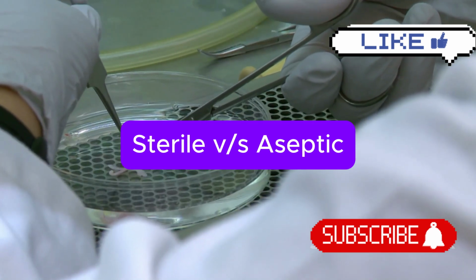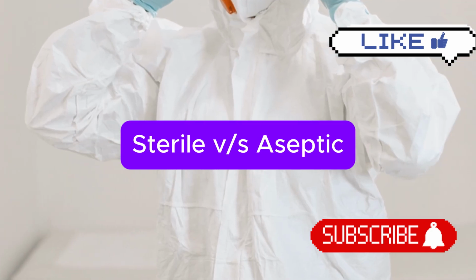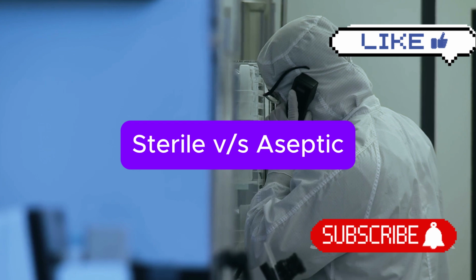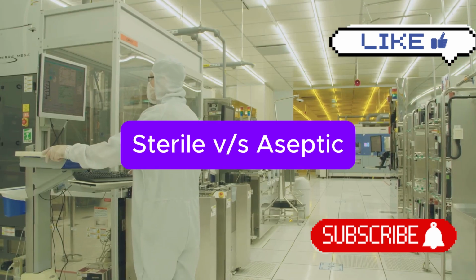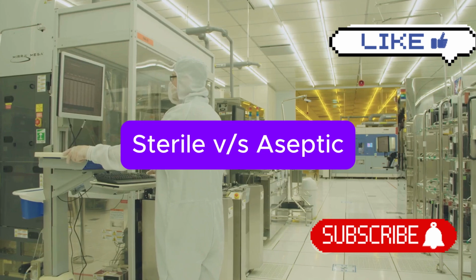Asepsis relies on a combination of techniques and practices. These include using sterilized equipment, wearing protective clothing, and following strict cleaning protocols. It's about creating a controlled environment where the risk of contamination is as low as possible.